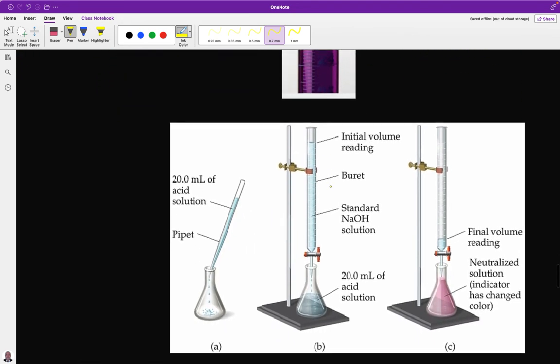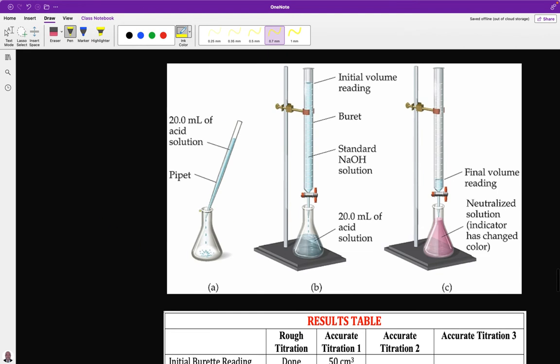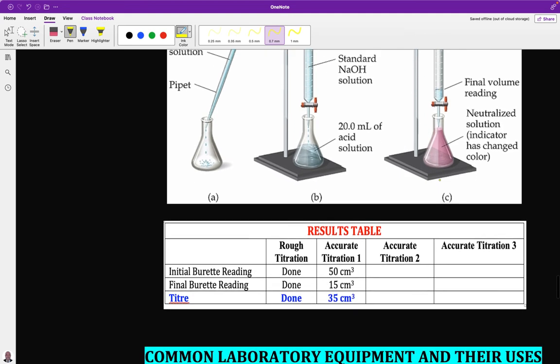After measuring the acid into the conical flask, we add an indicator using a dropping pipette, then titrate with the standard sodium hydroxide solution. We take our initial burette reading — say 50 cm³ — and after the reaction reaches the end point, we take the final burette reading. You need to read the meniscus level carefully, and that is how you present your results.